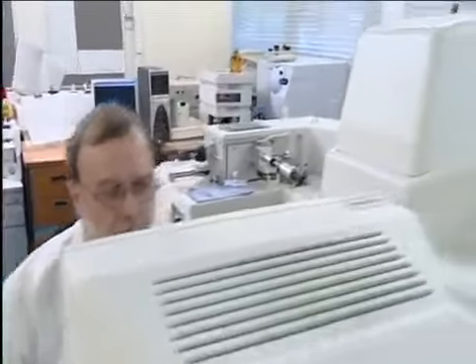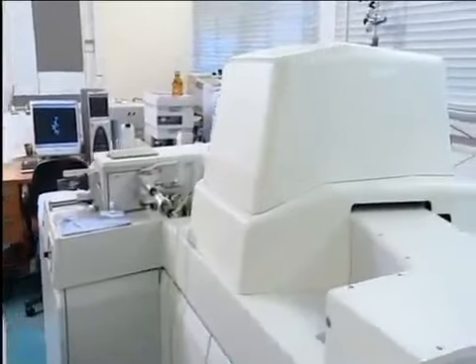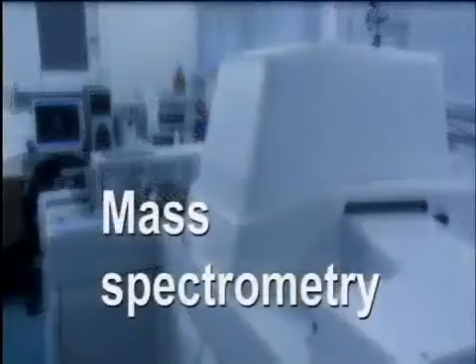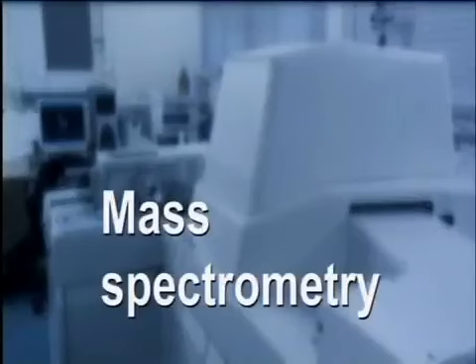Mass spectrometry allows chemists to weigh atoms and molecules not directly on a balance, but by measuring how ions formed from them are accelerated and deflected by electric and sometimes magnetic fields. There are many types of mass spectrometer, but they all work on this basic principle.